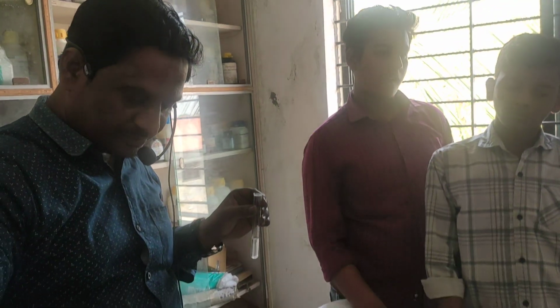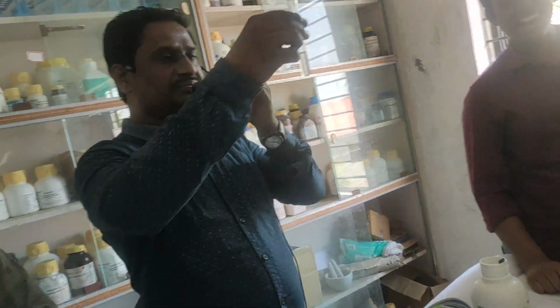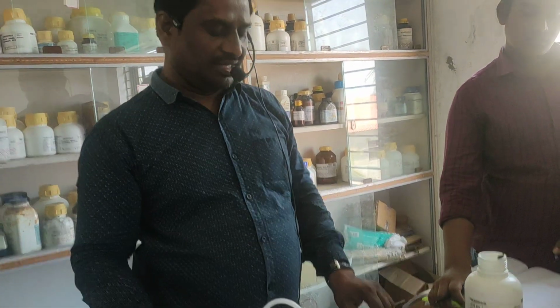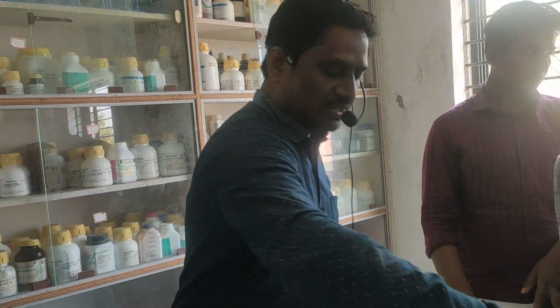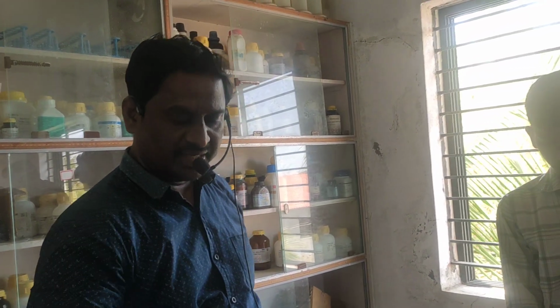So for group 4, what is there here? The last group, group 5, is present. Right, all of you? Original solution plus NH4Cl plus NH4OH plus (NH4)2CO3: precipitate, group 5 is present.